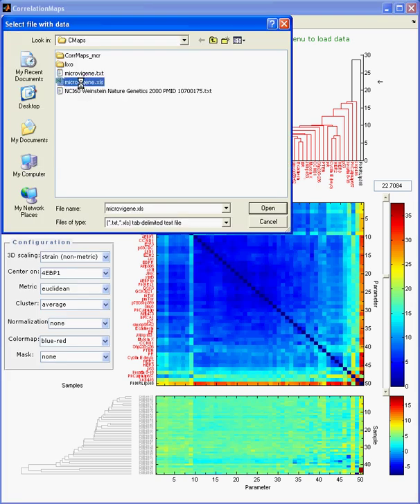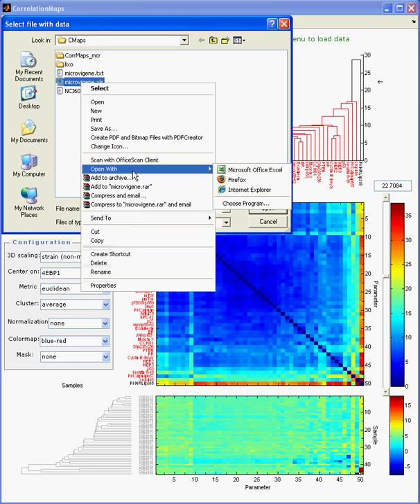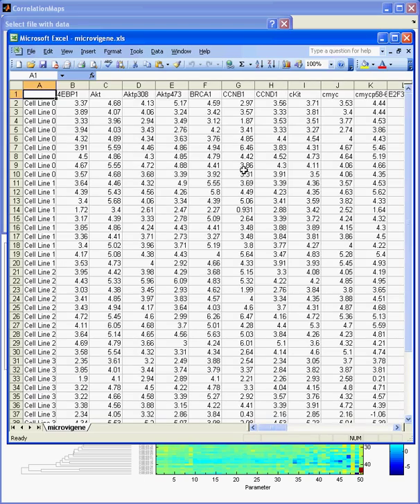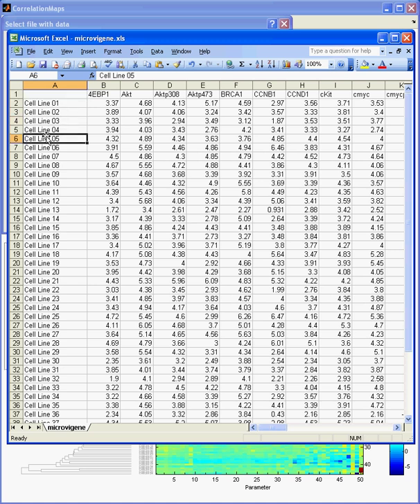Let's have a closer look at the data. This is some older data — I don't really remember where I got it, I think it was from Brian. The data format is nothing special. The first column has sample names, and I didn't have sample names so I made them up by numbering them. And the first row contains the antibody names.